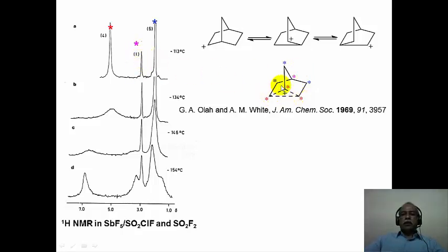So there are 3 types of hydrogens in this molecule under the conditions of rapid interconversion. However, when the rearrangement is considerably slowed down, the molecule is an asymmetric, chiral molecule, and as a result, each one of the hydrogens is different. So you essentially see a complicated second order kind of pattern, which is not easy to assign for any of these structures straight away.